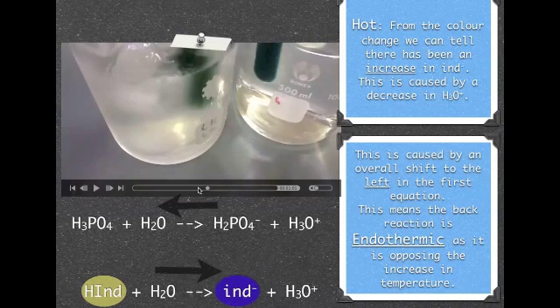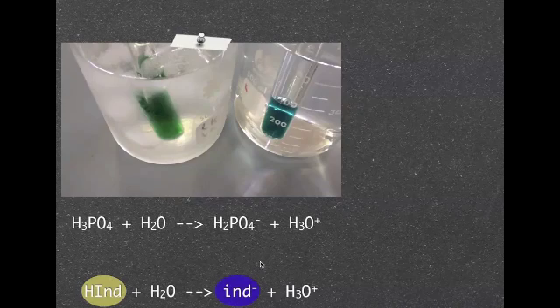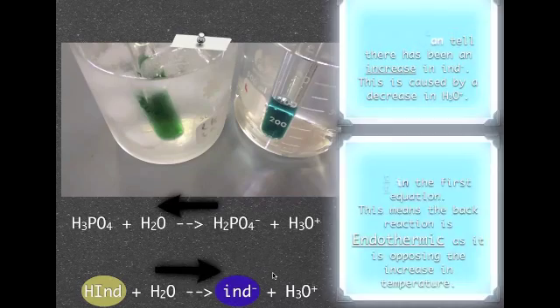If I move back, you can kind of see it a bit better. There, you can see it's a bit different there. So that means we've had an overall back reaction here occur.